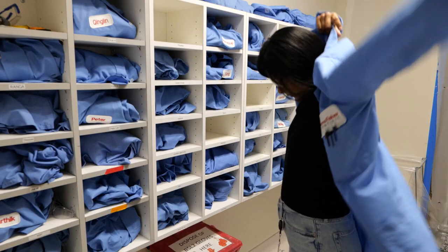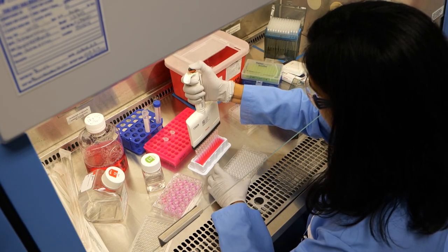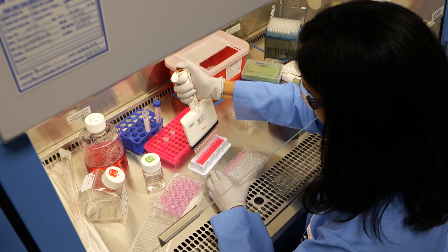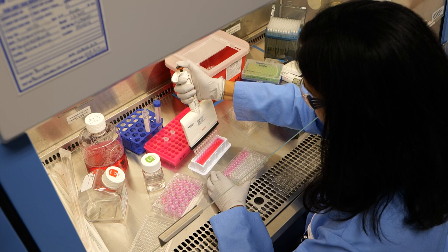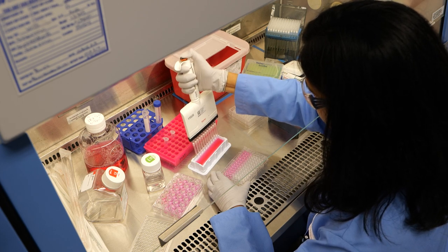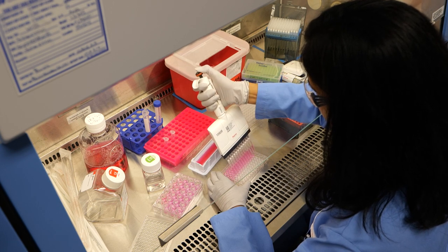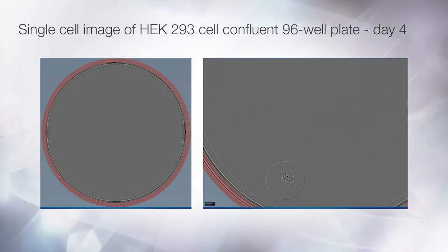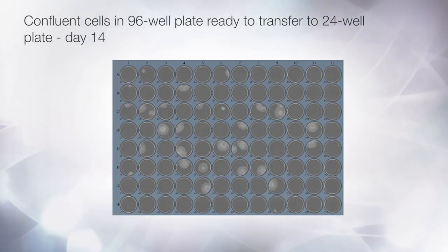After GCD demonstrates efficient indel formation, the cells still in culture can be isolated and clonally expanded. Collect then count the cells and resuspend them to a density of 8 cells per mL in 50 mL of complete GRIF medium and transfer to a sterile reservoir. Using a multichannel pipette, transfer 100 µL of the cell suspension into each well of 96-well tissue culture plates until the desired number of plates are seeded. Make sure to mix cells in between seeding the plates to avoid formation of cell aggregates. In general, we recommend seeding 10 96-well plates to achieve a large number of clones.